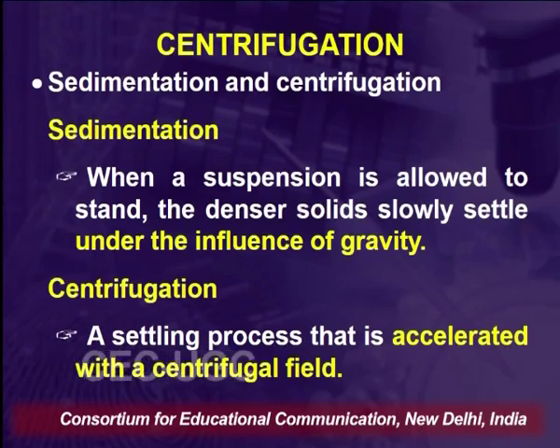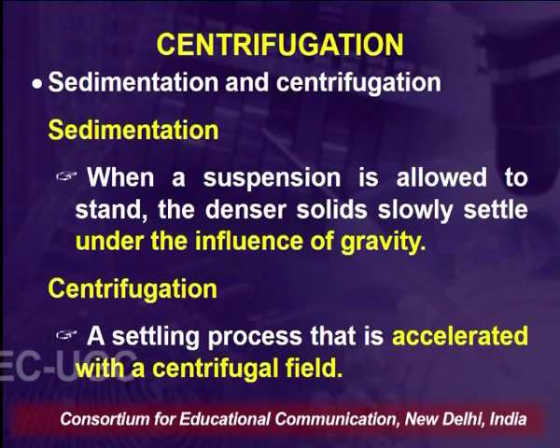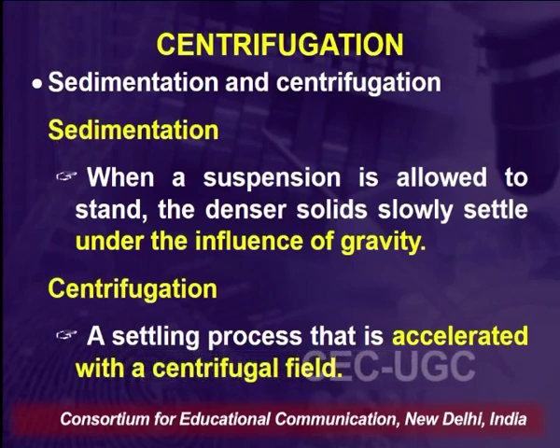So, whenever we talk about centrifugation, there are two terms we need to learn. One is sedimentation and one is centrifugation. When we say sedimentation, when a suspension is allowed to stand, the denser solids slowly settle under the influence of gravity. So, that is sedimentation. The principle of sedimentation is used in centrifugation. It is a settling process that is accelerated with a centrifugal field.